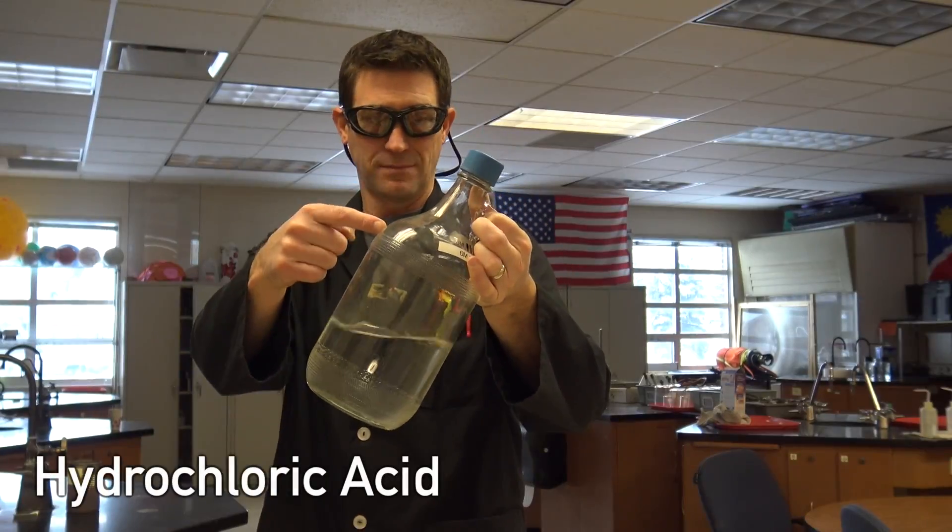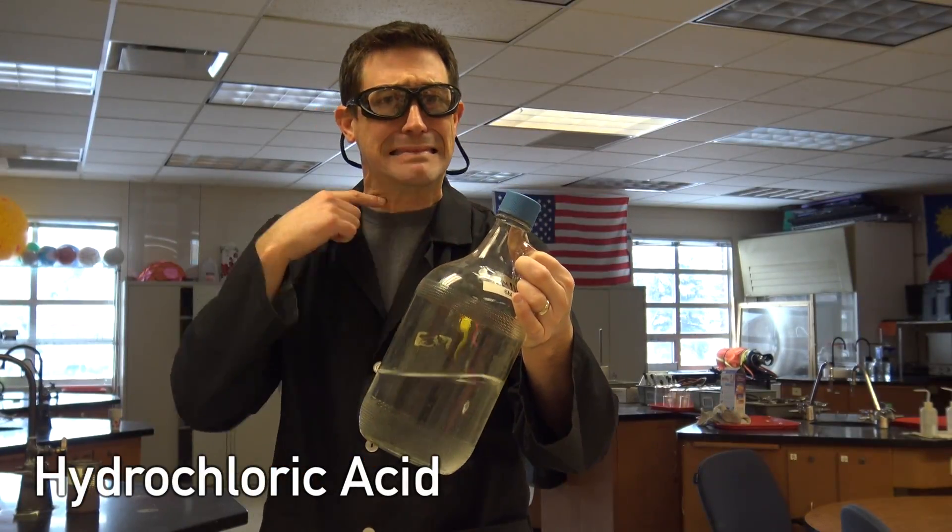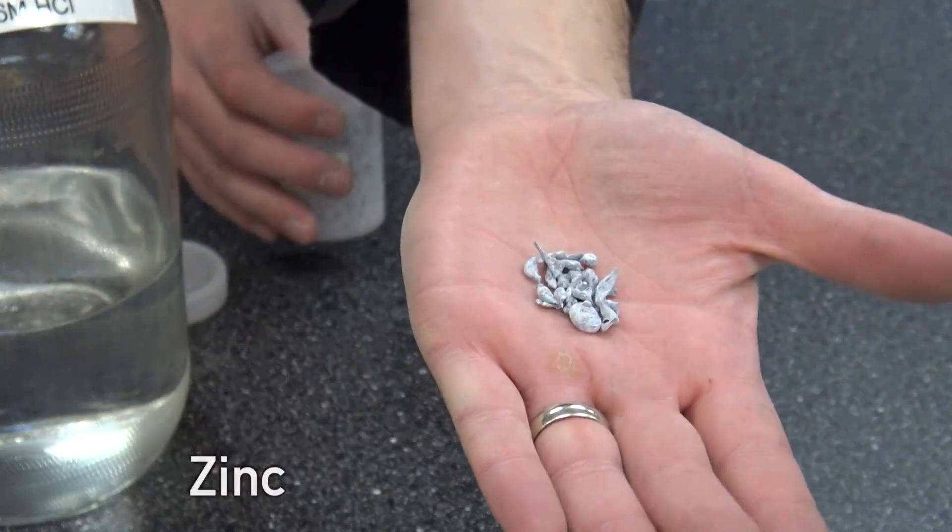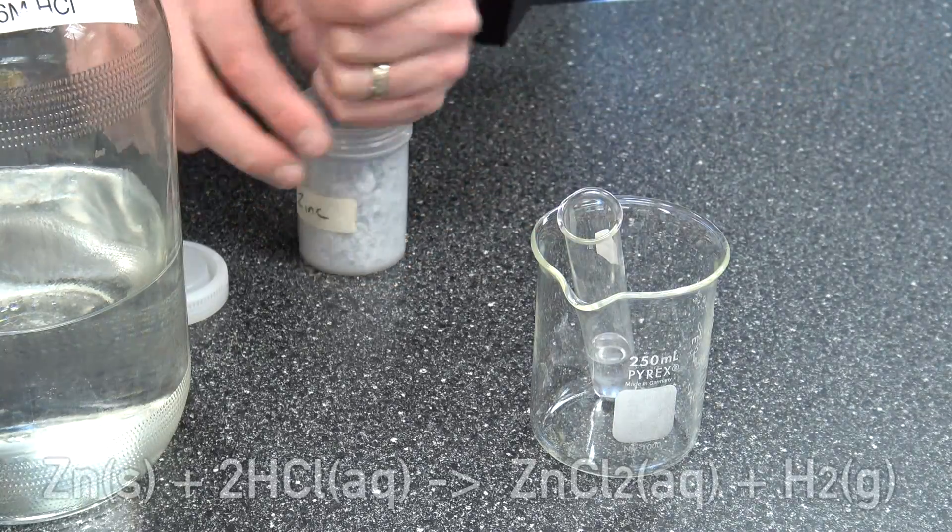Now we're gonna soak this in hydrochloric acid. I'm using six molar hydrochloric acid but you could use three molar. Now hydrochloric acid dissolves the zinc. Here I'm gonna prove it.